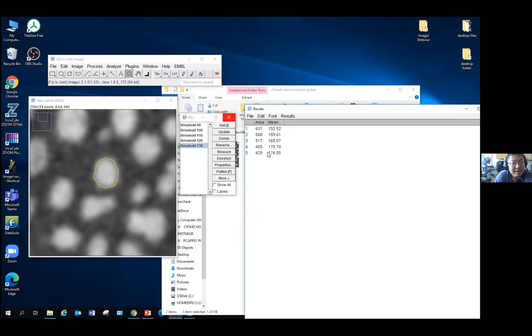I believe in most cases, if you're doing the experiment, once you see the parameter you want to check between the control and the experiment has a 50% difference, you're very happy. That's definitely something we can write a paper on. But this is actually the same image, just using different thresholding methods on it. And the best thing is, they all look reasonable. You can't really see anything wrong with it. Those are just different choices.